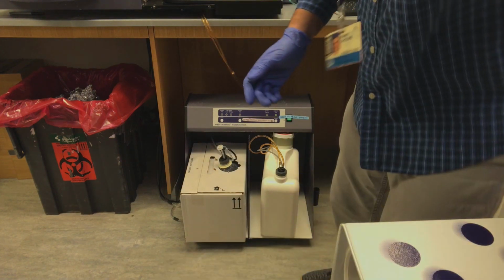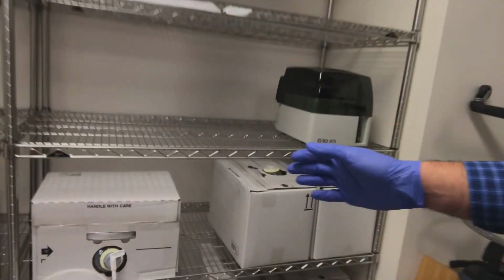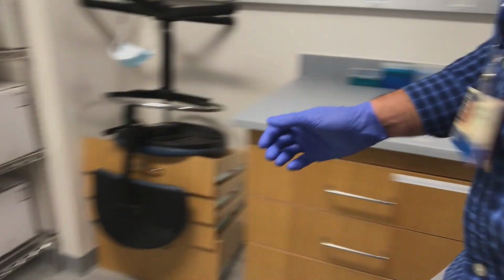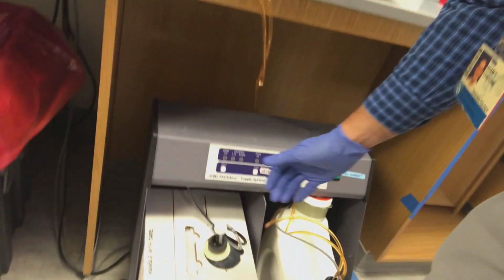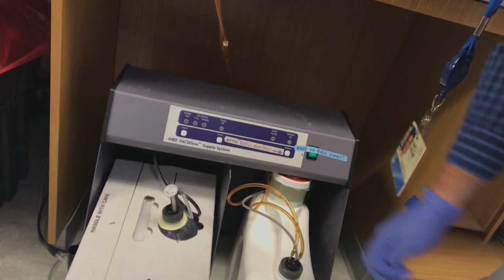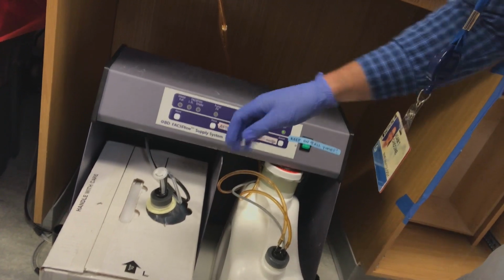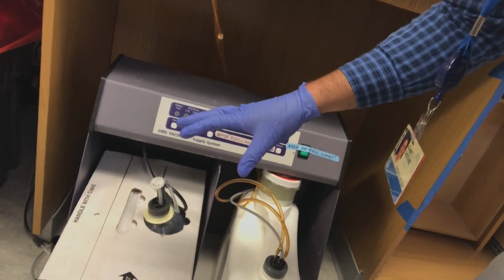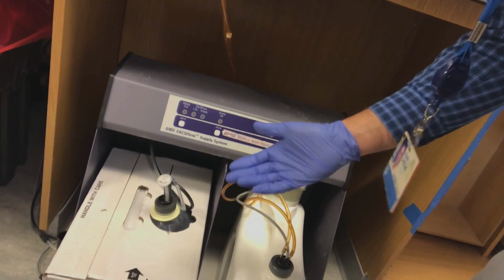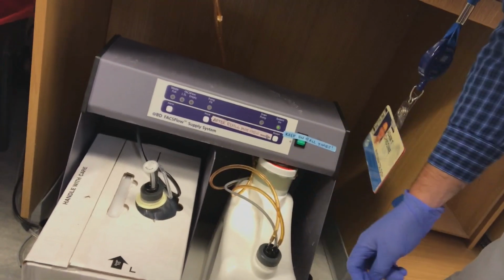Pour sheath fluid from any one of our tanks here into the graduated cylinder and funnel. Place the funnel into the top of the tank and pour the graduated cylinder full of sheath fluid directly into the funnel. Do not allow the funnel to fill with liquid. Pour directly down the downspout so that you can monitor the level in real time very carefully as to avoid spill.